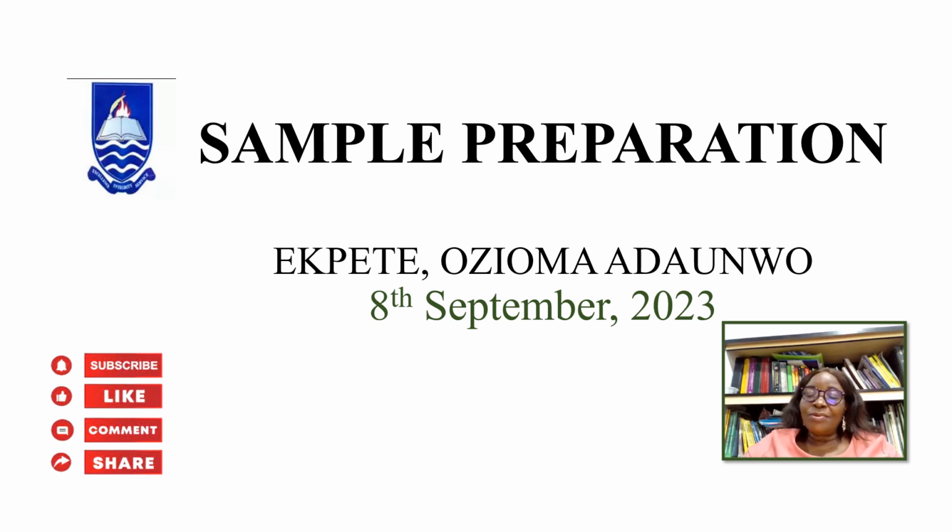And I am excited to deliver this lecture. Today, we'll be looking at sample preparation through ashing.